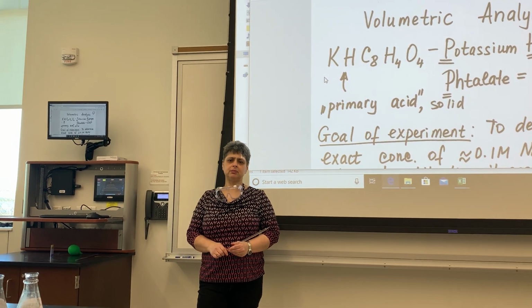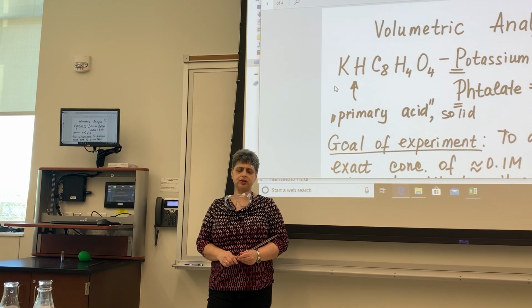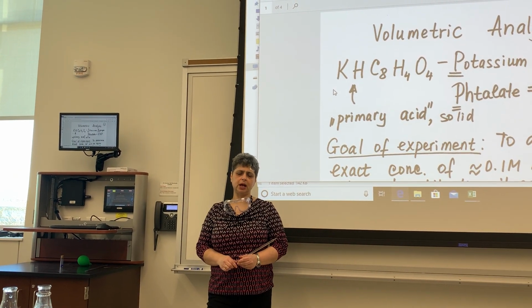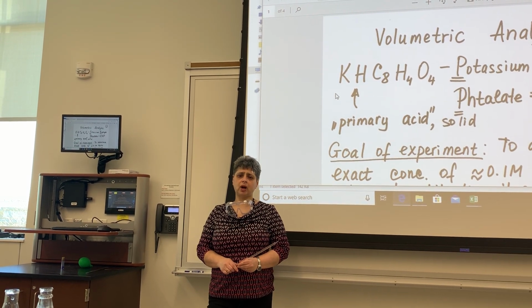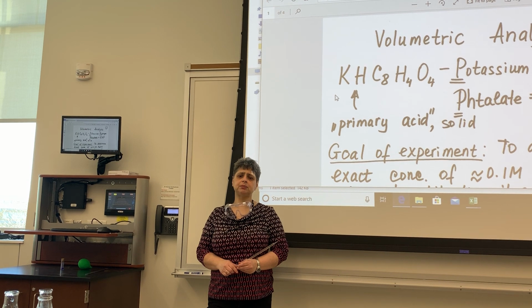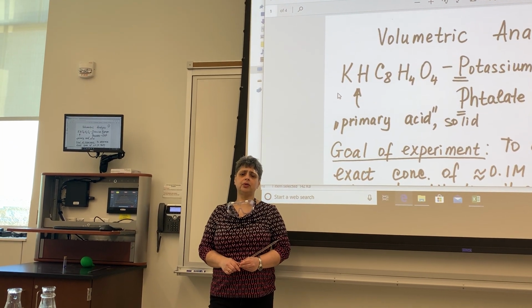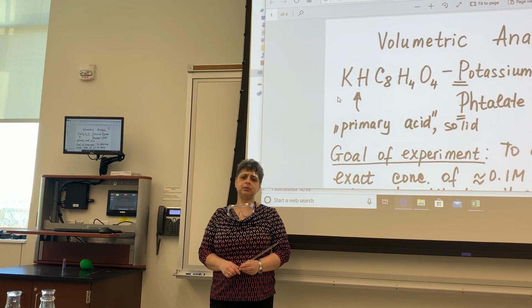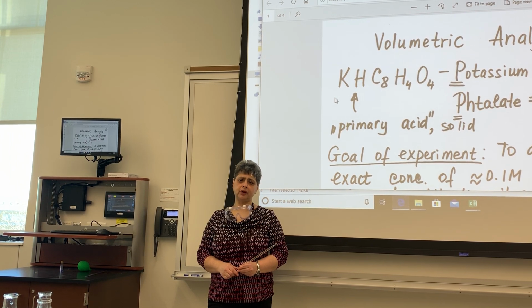This week we're talking about titration. The title of the experiment is volumetric analysis, which basically means determined by volume. Titrations are very important in chemistry. They cover a wide variety of approaches and techniques, but the goal is generally the same, and that is to figure out the exact concentration of a solution, which is typically added from the burette to another solution in the flask.